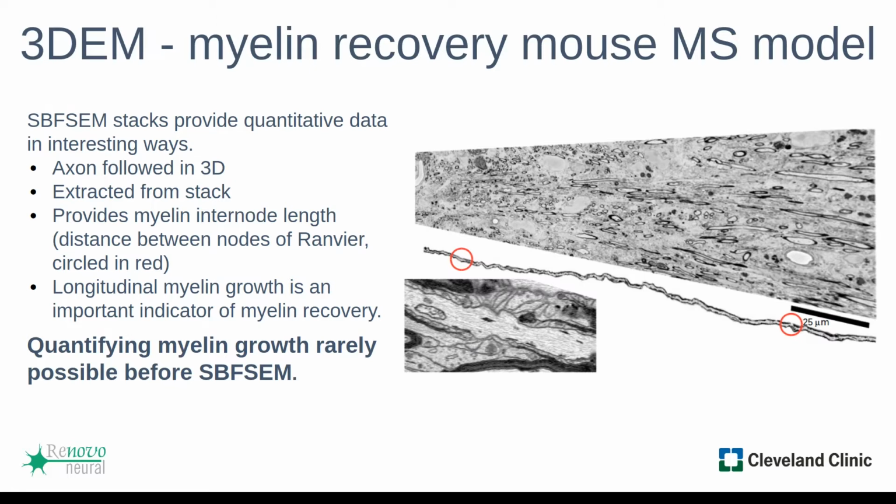And if anyone out there works on peripheral nerves, this can be thought of as a virtual teased fiber approach, because in peripheral nerves, since the axons are much larger and more robust, you can do this in real life, whereas here you do it virtually.